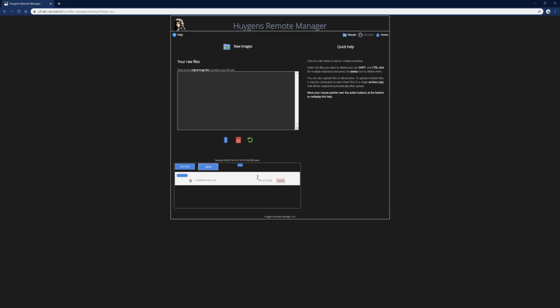So you can watch the progress of the upload here, and provided you are on a good connection, you can actually upload a lot of files pretty fast. And since we are on the topic of uploading files, there is a policy currently on the server to avoid saturation, and we automatically remove files older than 15 days.